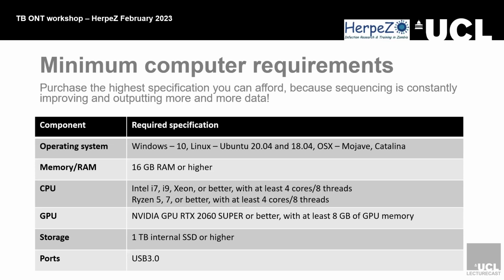viral genomes in terms of the software to analyze, but we are helping them with that. The only problem with a server is you have to have decent enough internet to be able to maintain that connection. With Nanopore, with Illumina, you don't have to have internet connections either. With Nanopore, certainly at the beginning, it connects to the Nanopore servers. So to begin with, you definitely have to have decent internet.